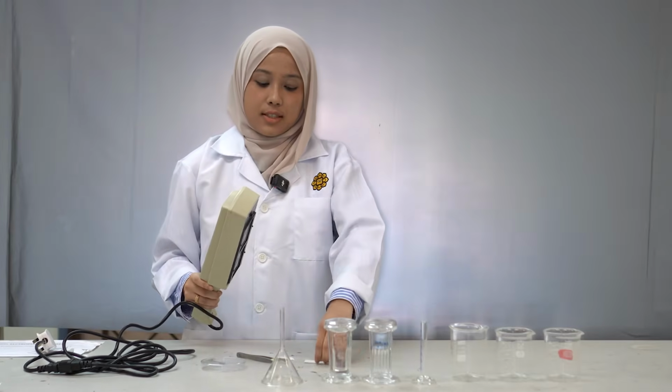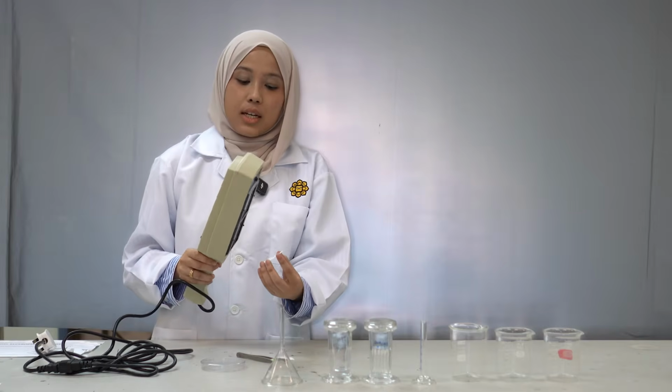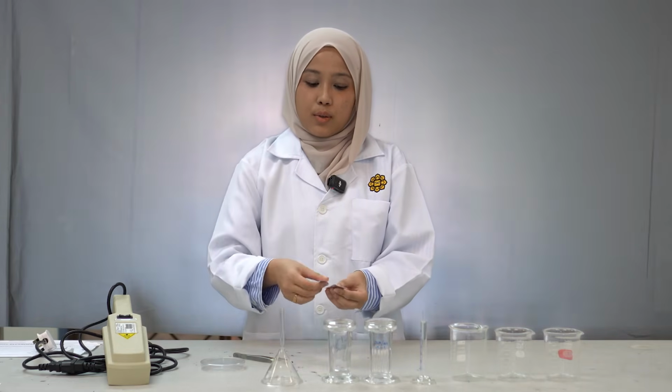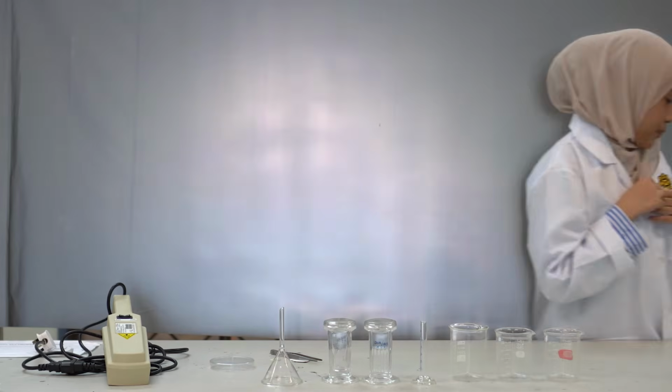Just visualize it using the UV lamp and we will see the spots. To mark them, use the pencil so that we can see them. Okay, so that's all from me. I'll pass to the last person.